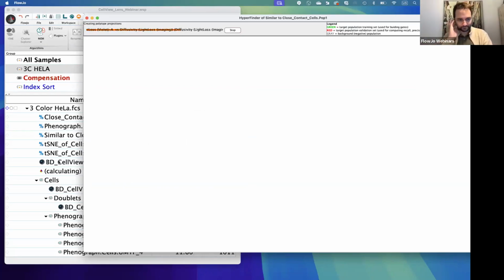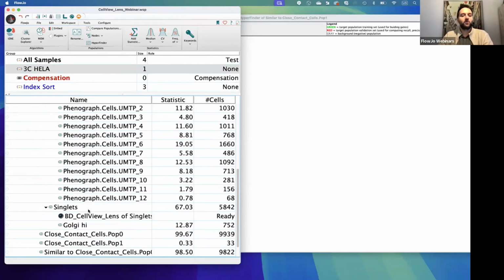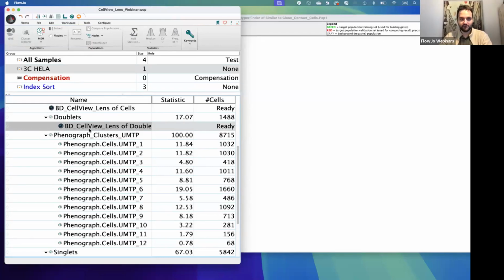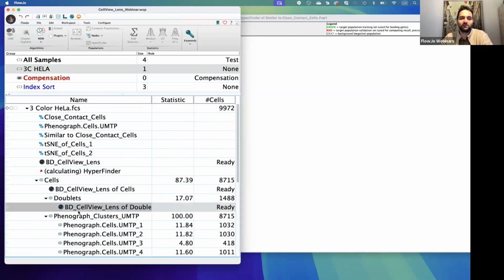And yeah, needless to say, when you perform dimensionality reduction, clustering, and all those tools, you can always still drag and drop the plugin node into a separate cluster and see which images we have in there. You can further export the images. There is really a lot you can do with those tools, and this is where those tools get much more significance.